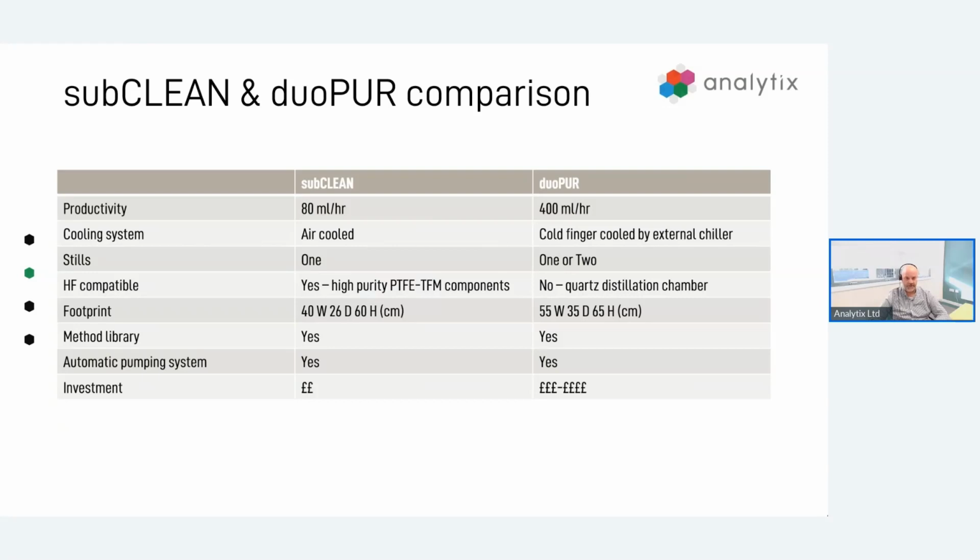So the third factor within here is really how the vessels that you're using are affecting your blank as well. Now, in terms of the microwave vessels, they have a propensity to retain the waste gases that are generated during the run. Typically, most microwave vessels, especially if you're working at the trace level, will be high purity TFM and not PFA vessels.